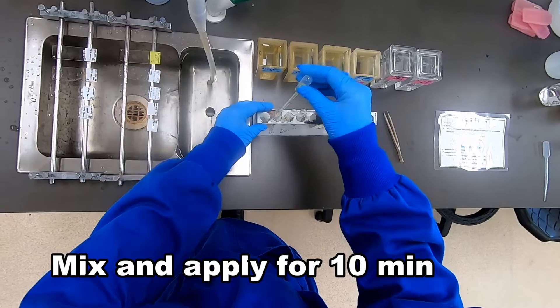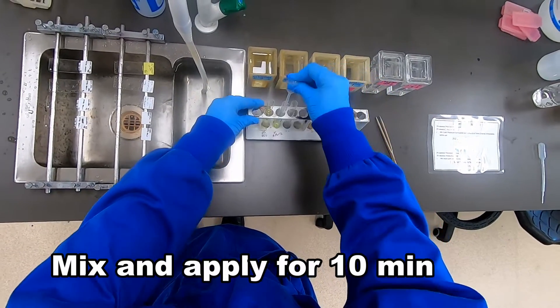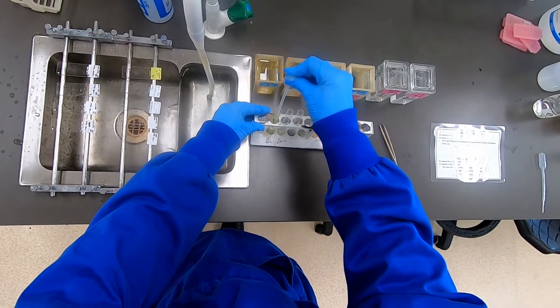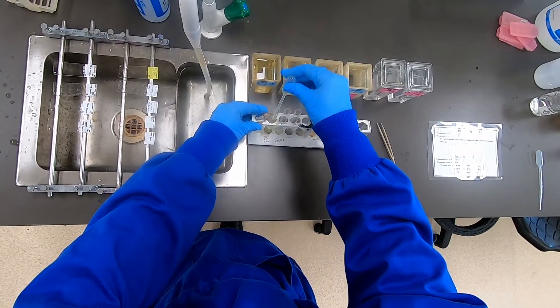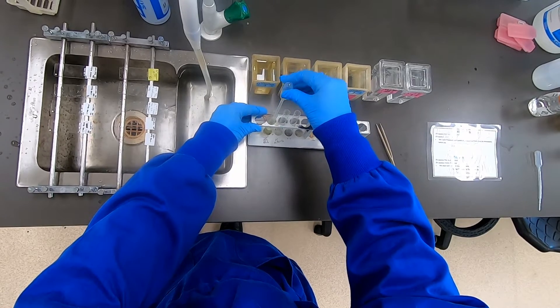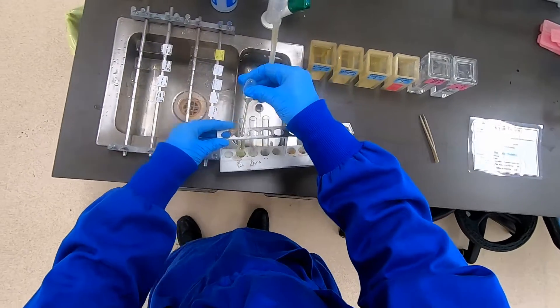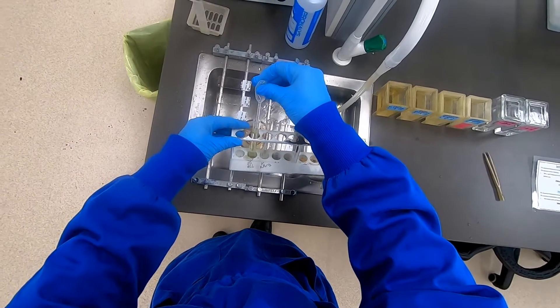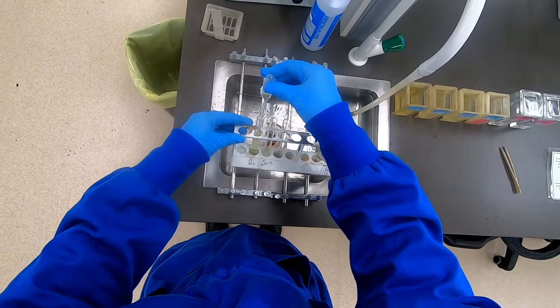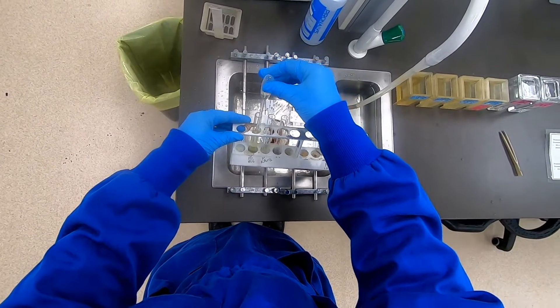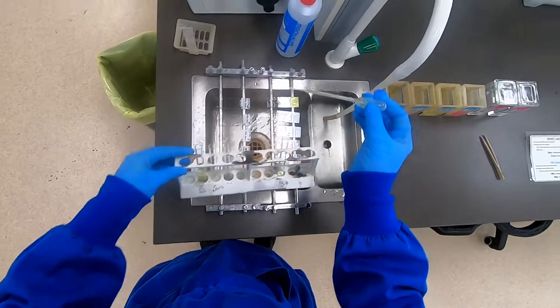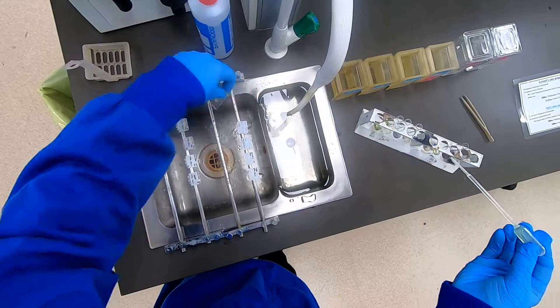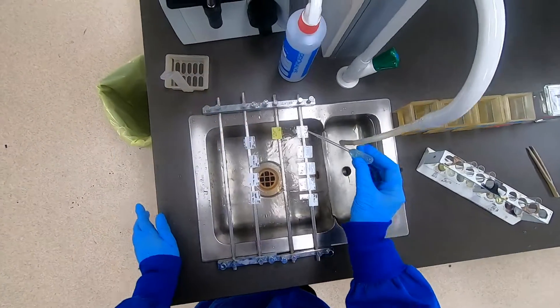We simply mix the 4 mL of the potassium ferrocyanide with our hydrochloric acid. Once that's been mixed well, we can place that onto each of the slides. Having a total of 8 mL gives us sufficient to put 1 mL per slide.